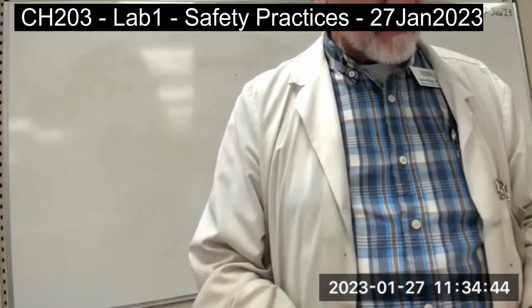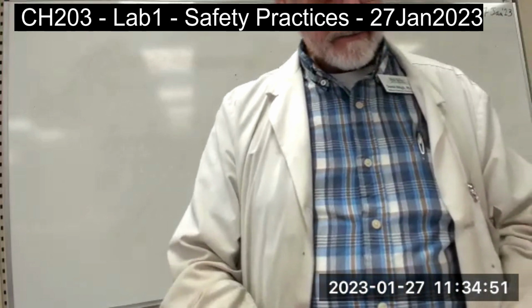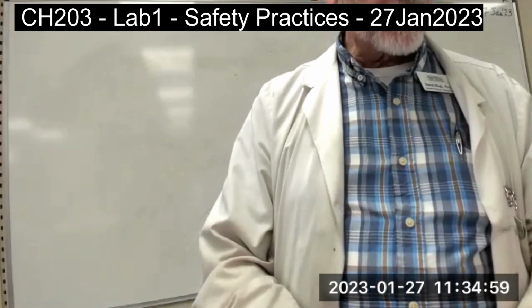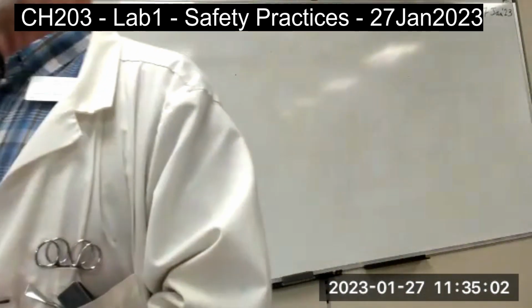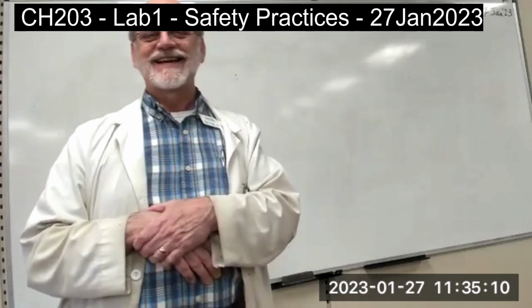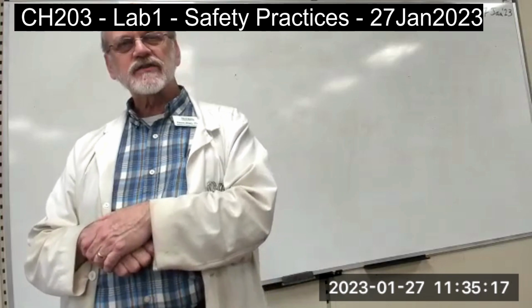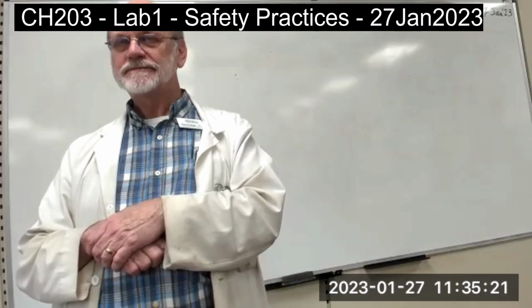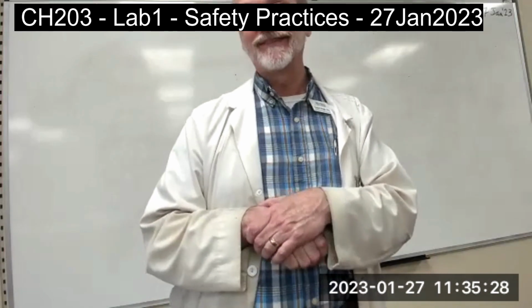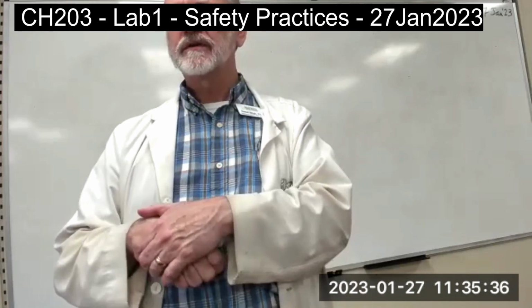So you've also got some instructions here on what to do for chemical spills, large area, small area, in the eyes. I don't think anybody's going to ingest chemicals. Burns, right? What do you do at home if you burn yourself on a hot item? I wouldn't want to do that first. First you cool it. You cool it as fast as possible. That limits the extent of the damage. And then it depends on how severe the burn is, right? If it's 3rd degree, you want to go to the hospital, right? If it's 1st degree, you can usually get away with that because most people have had 1st degree burns going to the beach.